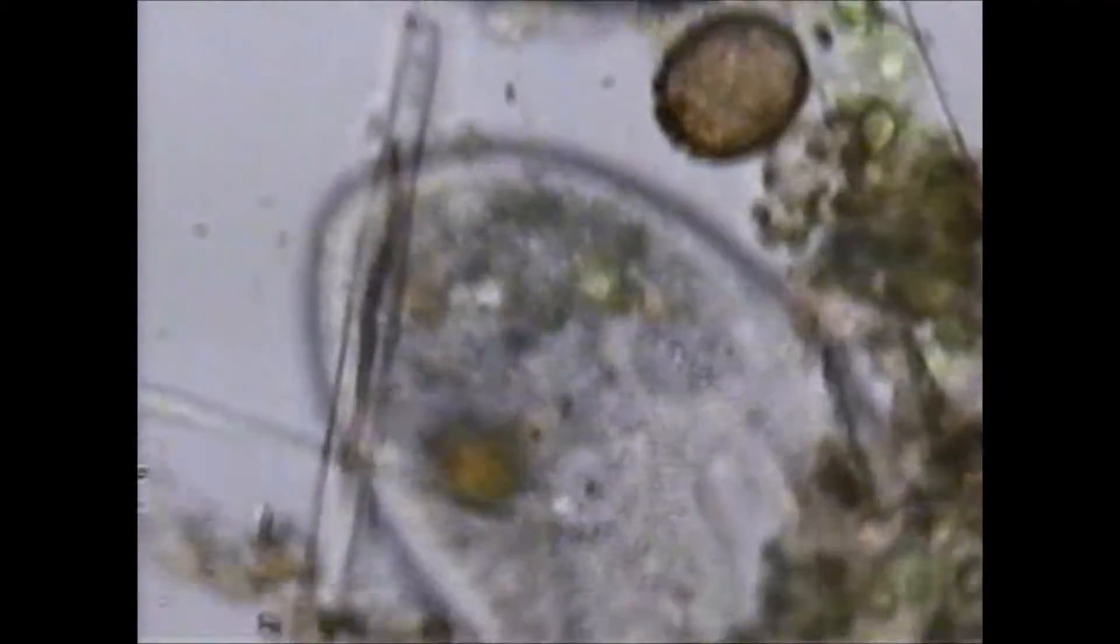The mouth is supported by membranelles and a single row of cilia fused together called the undulating membrane.